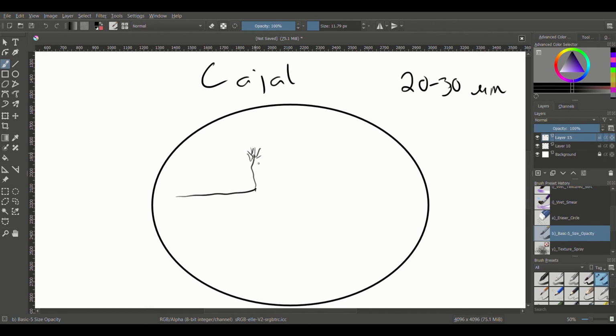So by the end of this whole thing, you're just going to see your astrocytes here. I'm probably not going to draw them very well, but the point is that we need to be able to see these tendrils coming off of our astrocytes.